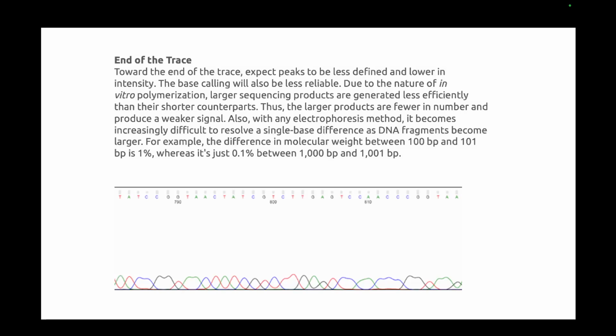If you remember, last class we discussed one of the drawbacks of Sanger sequencing, when you are doing an electrophoresis assay after using small sequences of DNA and synthesizing it. When you're doing this assay, it is easier to resolve two segments of length 20 and 30.